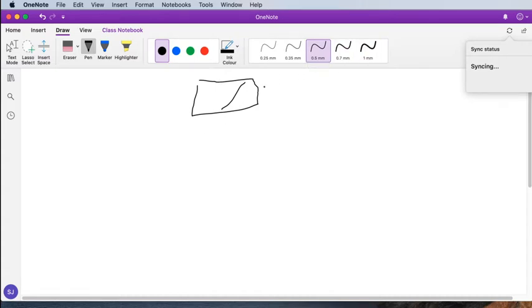This is the top of our tree. The top of our tree is the root of our file system, and that takes this symbol /. Okay, so here we've got /. I've drawn it in a box, and although it doesn't look very neat, it's kind of the best I'm going to be able to do, I'm afraid, today. I'll try and get this working properly for future lessons.